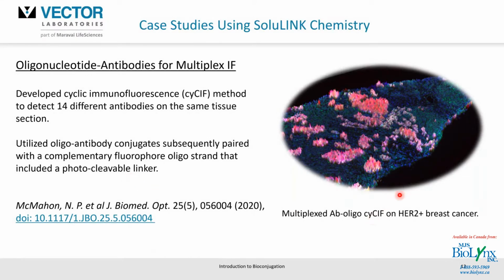So this actually is a very neat way for those of you out there who may be doing multiplex immunofluorescence or things like that. Some of you might be thinking, hey, there are no secondary antibodies here. And that's exactly right. These investigators were not hamstrung by having to use defined anti-mouse, anti-rabbit or anti-goat secondary antibodies and constrained with those parameters.